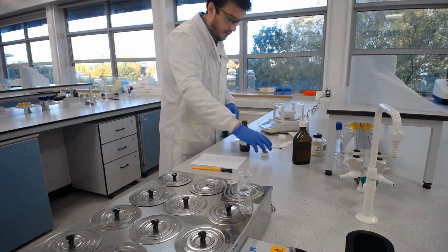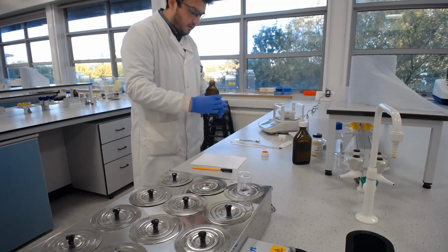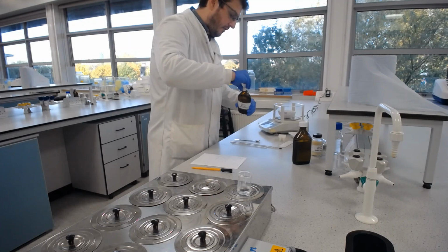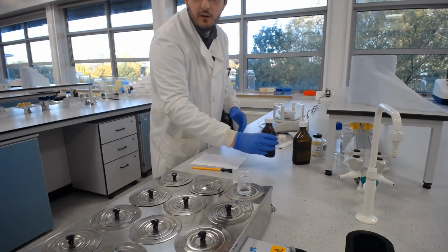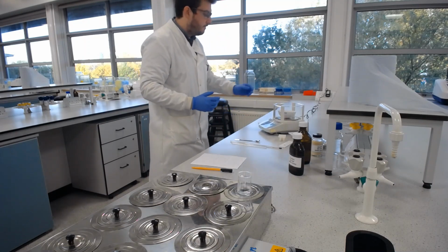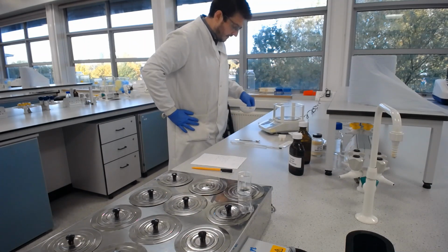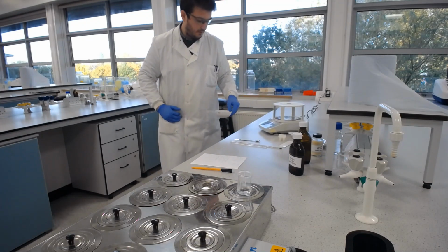Brilliant. So, for the purposes of this demonstration, that's good enough. I've got 7.1 grams of glycerol in there. Ideally, we'd have it slightly more accurate than that, but for the purposes of this demonstration, let's say I've got 7 grams on the dot. Now what I'm going to do is take that off, and I'm going to re-zero this.